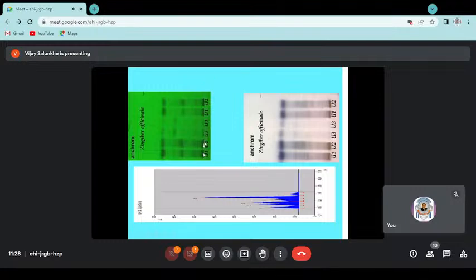In the development of the chromatogram, the phytoconstituents are separated, and the marker compounds move ahead in ascending order and adsorb at a particular spot. That's called the RF value. So you can compare the RF of the marker compound with the RF of the phytoconstituents present in your sample. Such color bands you can visualize on your plate.